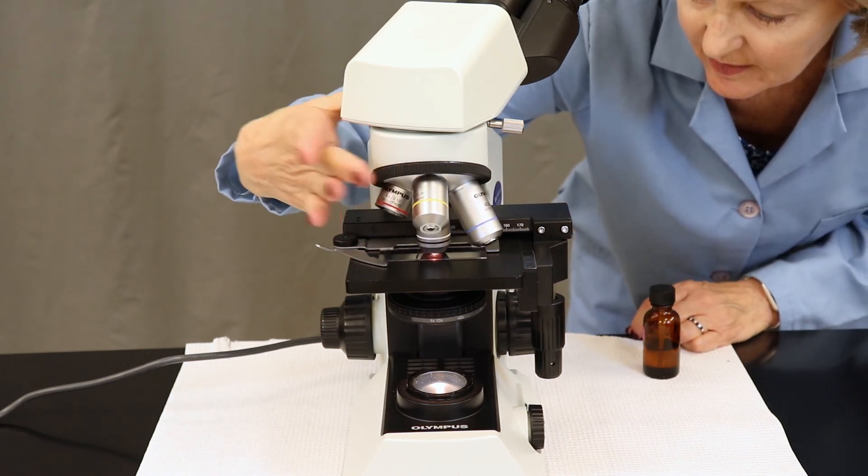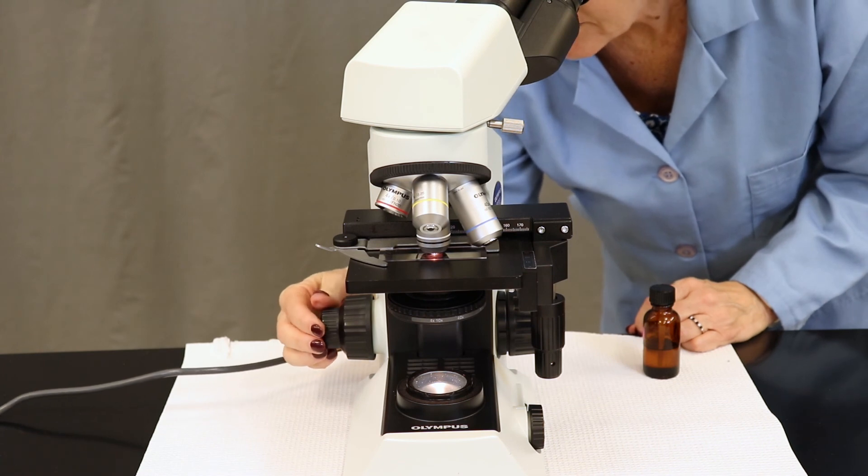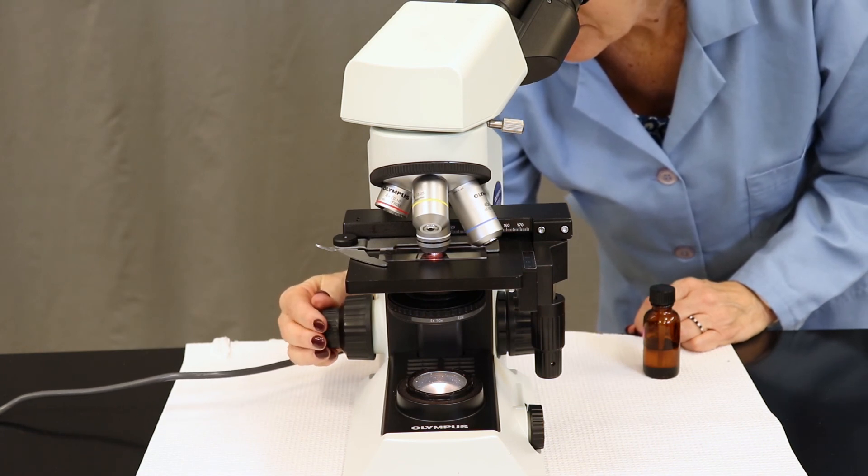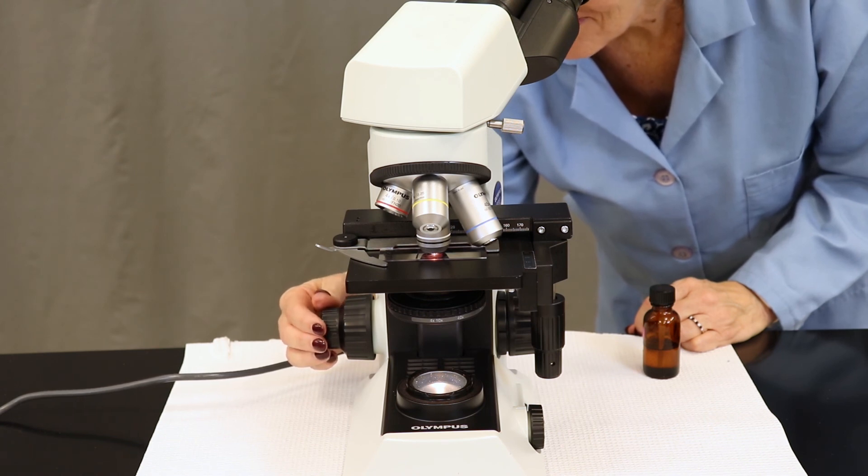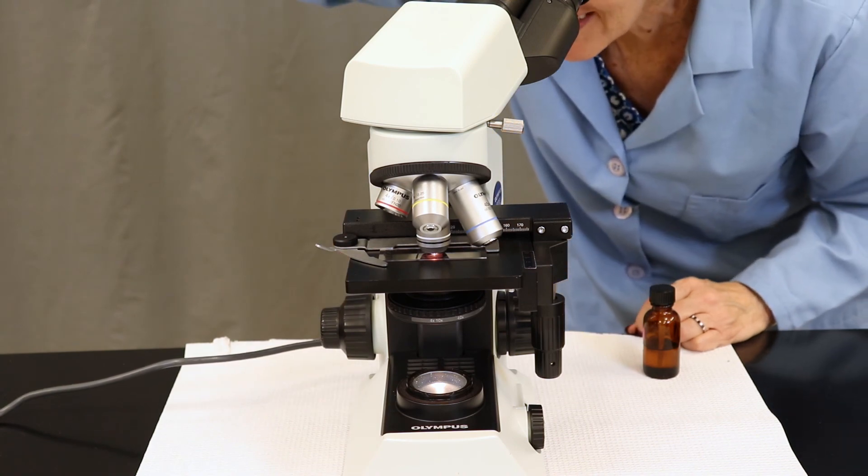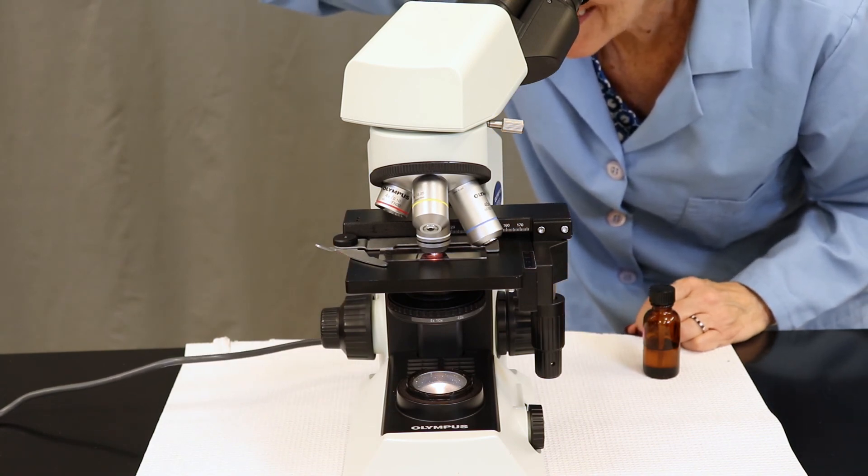It is possible that you used too much decolorizer in your staining process. You've perhaps washed away your cells. If stuck, don't hesitate to reach out to a partner or your instructor who can come over and help you.